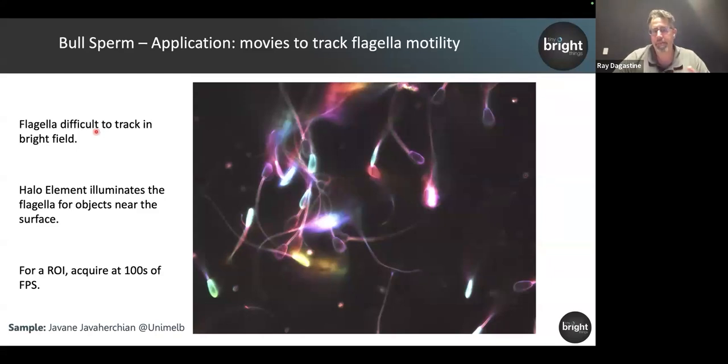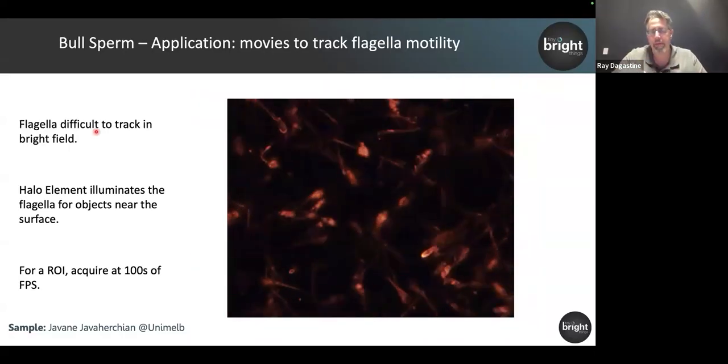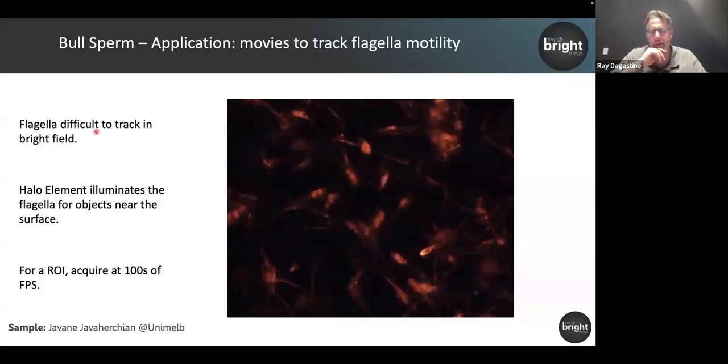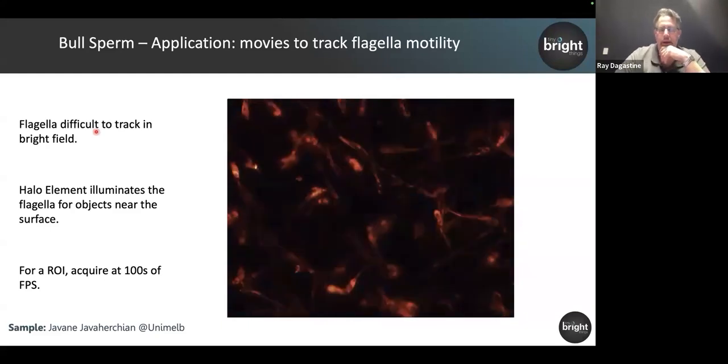And what was interesting is the flagella and the sperm only needed to be near the surface, and it would light pipe down the flagella, even if the whole flagella wasn't in the evanescent wave. But what we also did is if you go down and take a smaller image, you can acquire at faster rates. So I made a little movie. This was a smaller part of the image, and we're looking at sperm. This is 200 frames a second. It's a rough movie, and part of it was this was the initial work, and it's just way too many objects in the field of view.